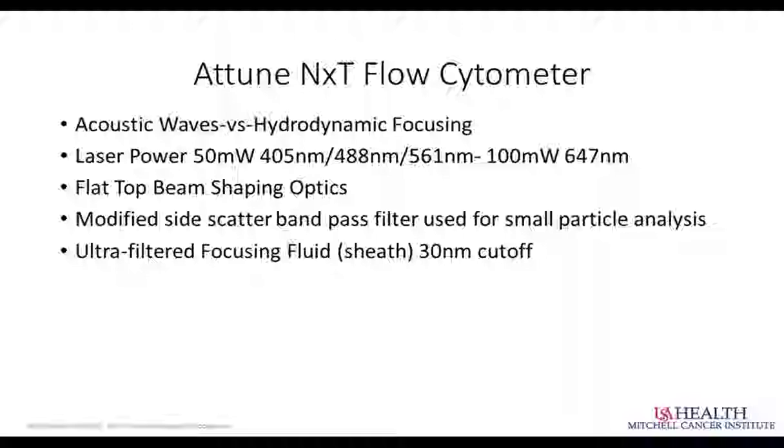So part of our collaboration that we've done with our friends at Thermo Fisher and the Invitrogen headquarters in Eugene, Oregon, have been assisting them to evaluate new bandpass filters. And we've been able to come up with a different filter than is normally supplied with the original instrument in front of the side scatter detector, and this has greatly increased the sensitivity of the system.